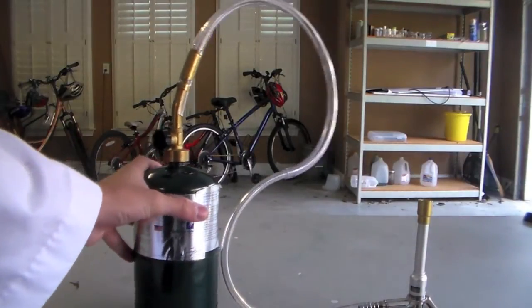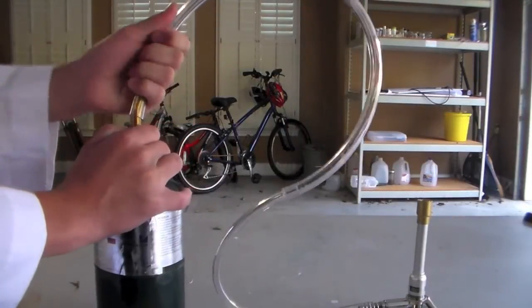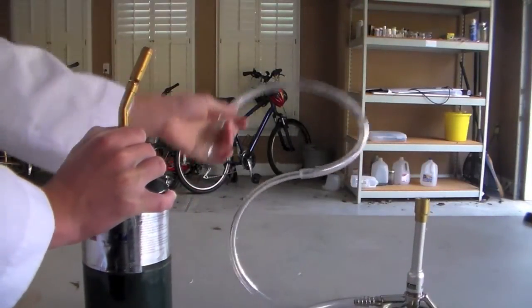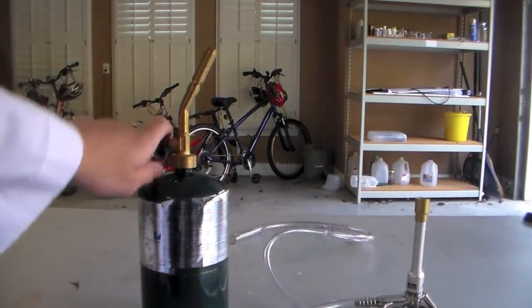Now the great thing about this design is that you can still use this as an ordinary propane torch. All you have to do is remove the tubing and just light it up like a normal torch, and you can see it fires right up.